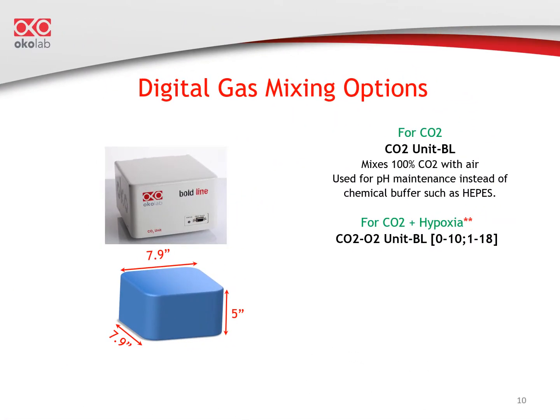We offer various digital gas mixers depending on what you want to control. They all have the same footprint and offer 0.1% accuracy on each gas. The most common mixes CO2 and air. There are options for hypoxia and hyperoxia.